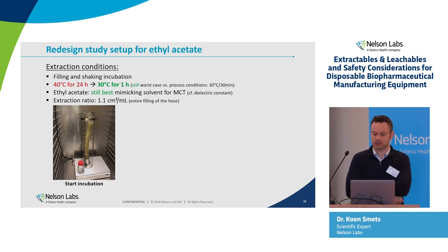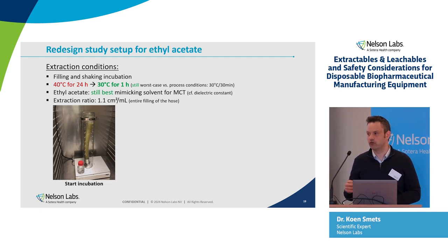So taking into account some additional information, we decided to go still with the filling and shaking incubation method, but to change the standard testing protocol contact conditions of 40 degrees Celsius 24 hours to 30 degrees Celsius for only 1 hour. So we are still worst case compared to the process, because at maximum 30 degrees Celsius, maximum 30 minutes. So that should still be okay in that condition.